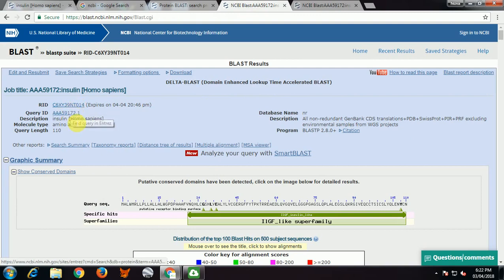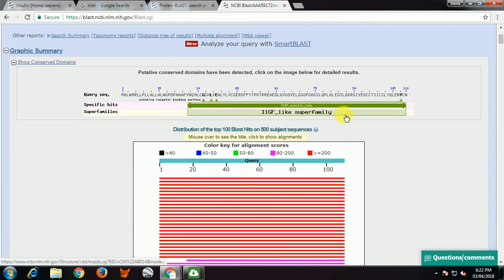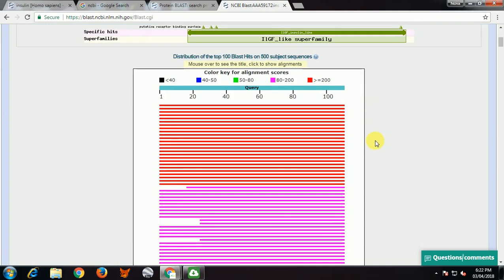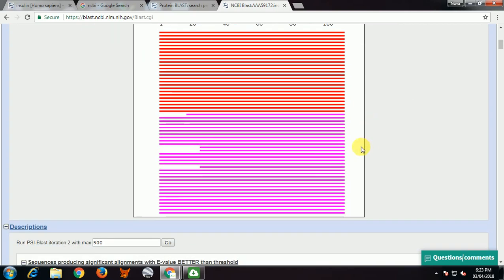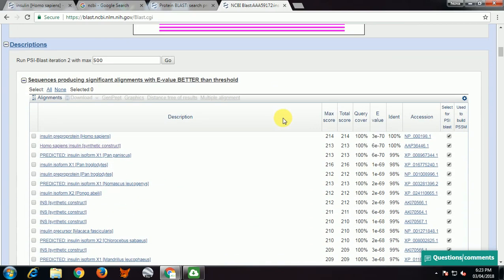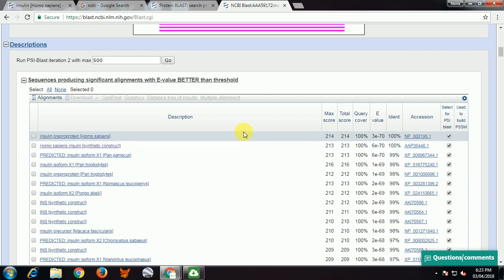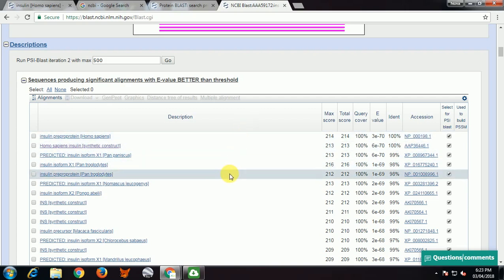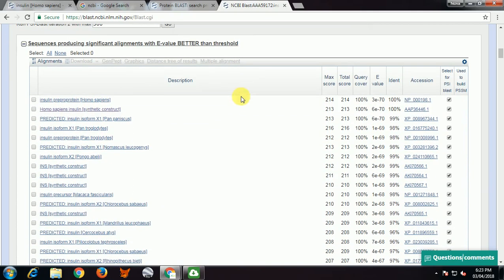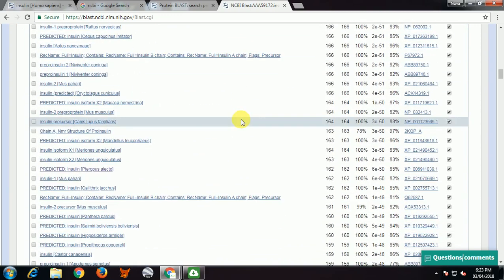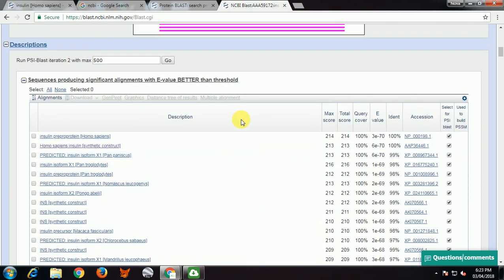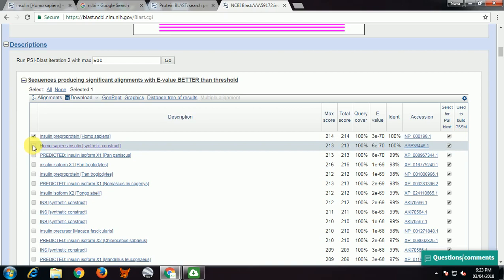Now we will see Delta BLAST. Just select Delta BLAST and keep all other parameters the same as the previous BLAST program. Scroll down and see the alignment. Insulin-like growth factor-like superfamily details are given. The red color sequence is insulin pre-protein Homo sapiens, and the second is synthetic construct of Homo sapiens insulin. Identity is 98% for that result.